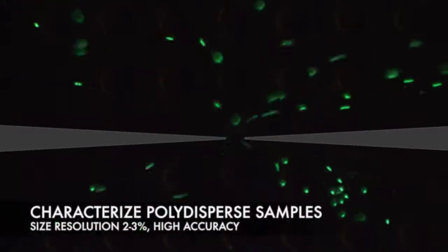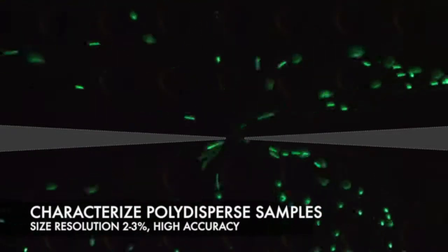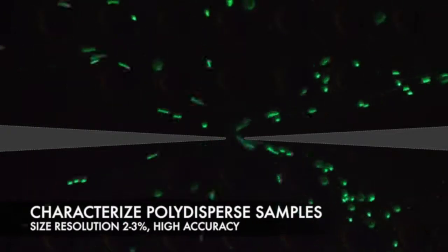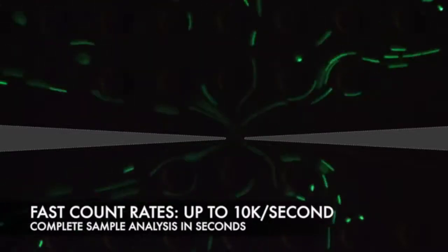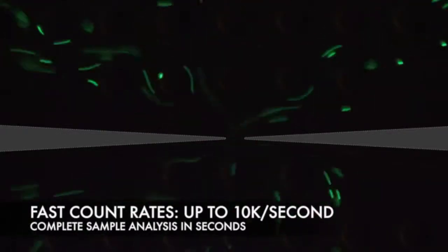The NCS-1 can characterize polydispersed samples with very high resolution, accuracy, and repeatability. It's also very fast and can characterize up to 10,000 particles per second, meaning your complete sample analysis takes place in seconds.